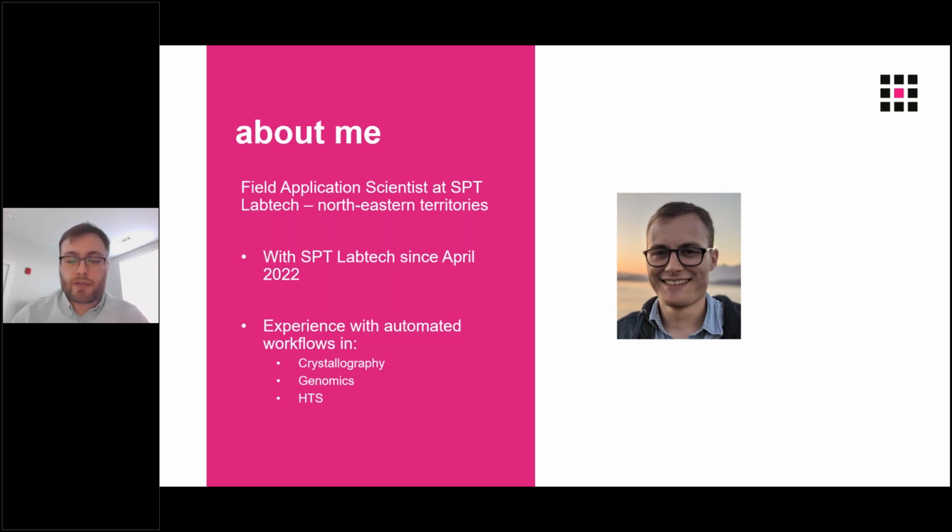In fact, my background was using a Mosquito for setting up crystal trials and crystal trays. I've also, however, learned with SPT LabTech how to use SPT's liquid handling instrumentation for genomics applications, including library prep and miniaturization of library prep, and also drug discovery and high throughput screening.